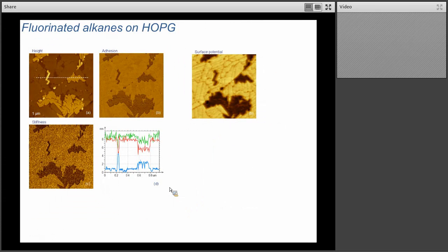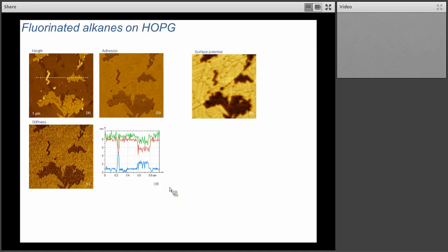Some representative examples from NT-MDT, a company that manufactures AFMs. We've got carbon nanotubes on a silicon surface — you can simultaneously map the conductivity, with an electrically conductive tip, and the elastic modulus of the surface. These are actual numbers, not just pretty pictures. Another example: fluorinated alkanes on graphite, with each image being one micron across. Height, adhesion, and stiffness were all taken simultaneously. You see ordered layers of alkanes with different molecular orientation, different adhesion, and different stiffness. The image on the top right shows the surface potential — the contact potential difference between the probe tip and the surface. These are things you can measure with AFM — it opens up so many possibilities beyond just basic topography imaging.